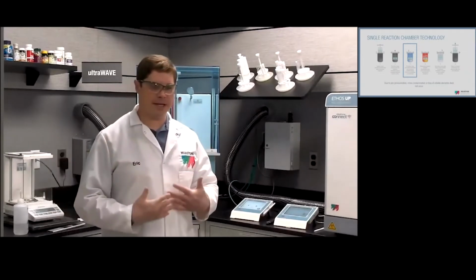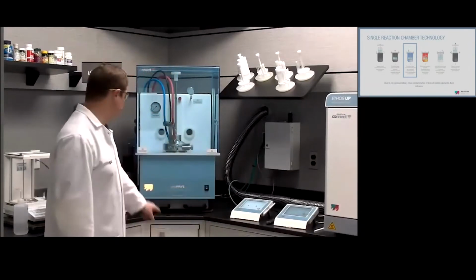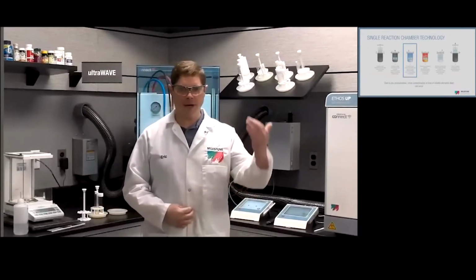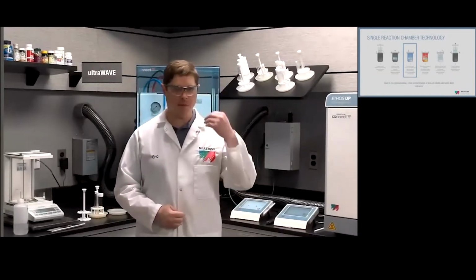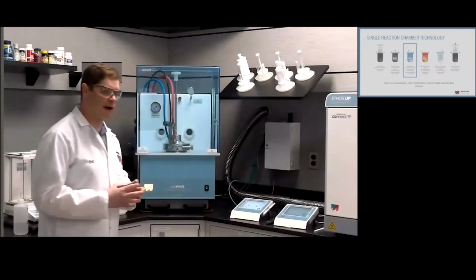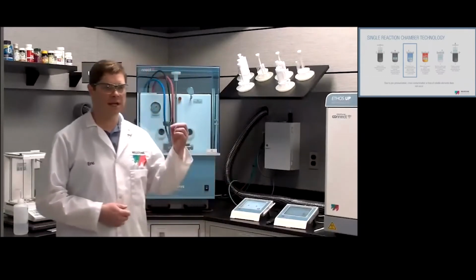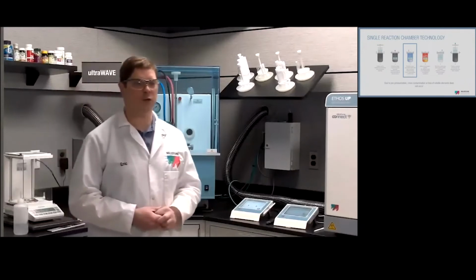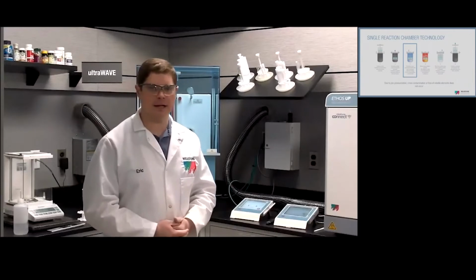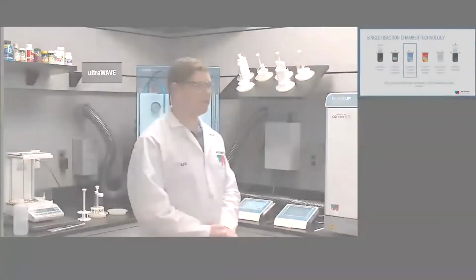With a setup like this in your lab, once you press the start button, you can go away and do something else and come back when that light turns green. Then you know your digestion is complete. The system will automatically pull down the active cooling from the chiller. The chiller not only keeps the reaction chamber at a safe operating temperature, but provides that active cooling. You can go from 250 Celsius down to pressure released in about 20 minutes or so. Once the system's completely released, you can look at step number 6 on the right. We're going to go ahead and open up the reaction chamber and dilute up the samples.